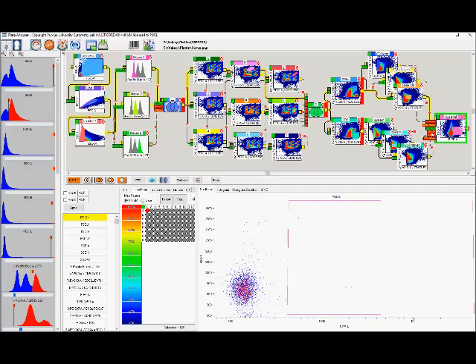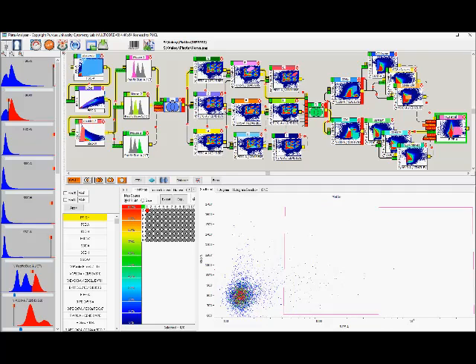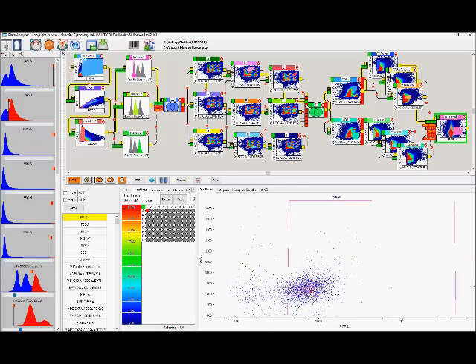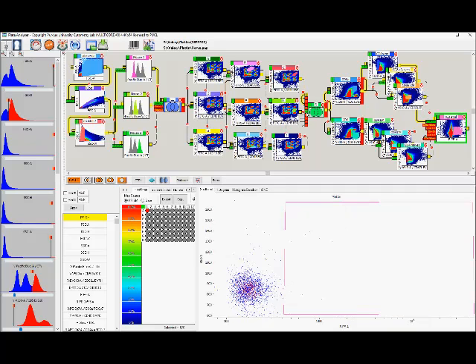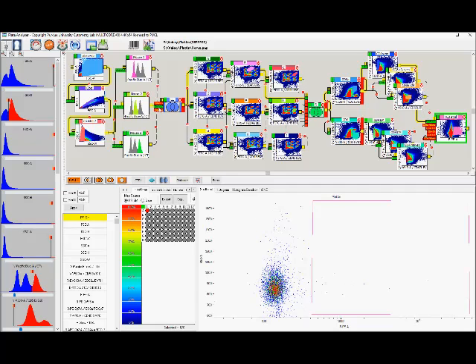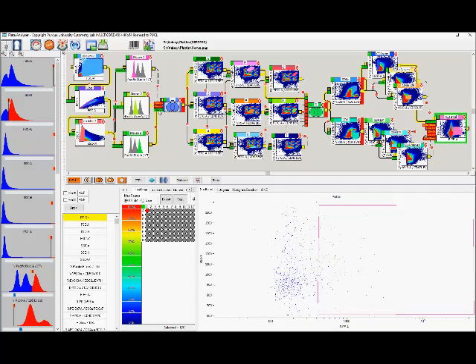And since this is linked to the CD4 modal, this will now give you those modal numbers. And you still can switch this. And you can go back over here since you've got these modal. So going up to the CD8s, if you now go through here one at a time, it'll only show you those barcodes, right? And then if you want to go back here, you can show that same population just with the mouse. Mouse 1, 2, 3.